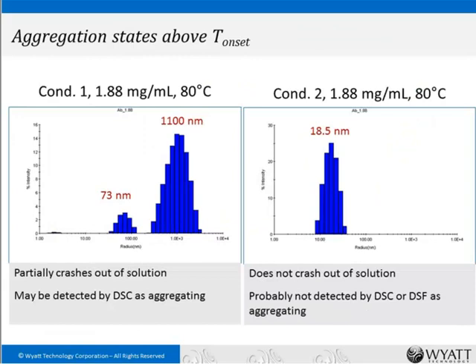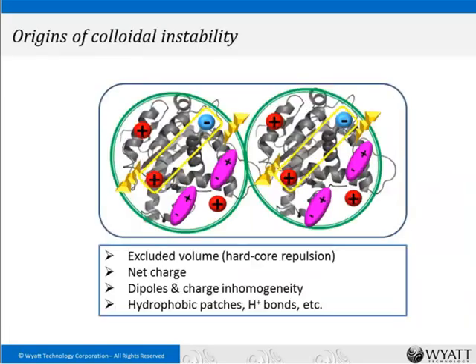For condition 1, which had massive aggregation, we see populations centered around 73 nanometers and 1,100 nanometers — basically crashing out of solution. For condition 2, which gave stable, smaller aggregates, there's a distinct population centered at 18.5 nanometers. Techniques based on fluorescence or calorimetry might indicate crashing out of solution but wouldn't tell you what was forming. DSC or DSF would not indicate that past the thermal transition, this aggregation is occurring. Dynamic light scattering gives lots of critical information in these screens.